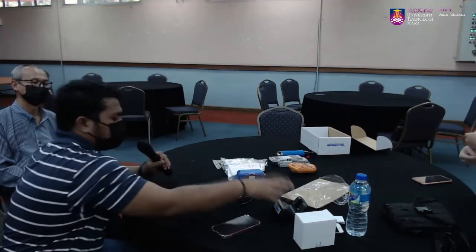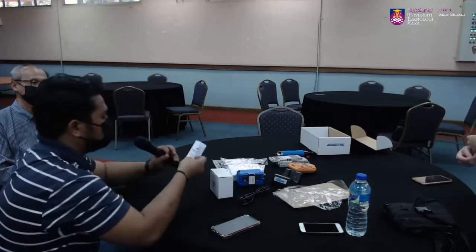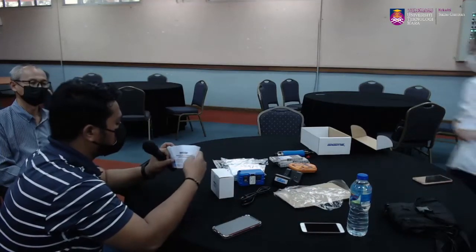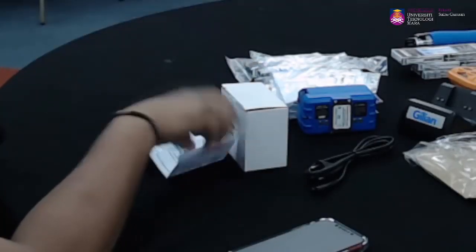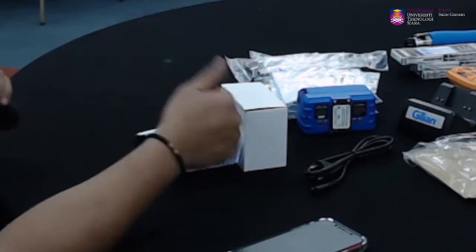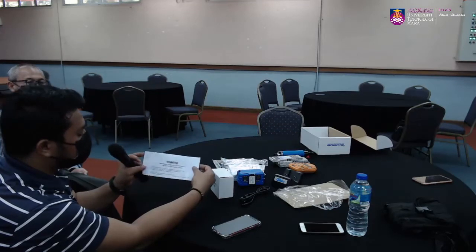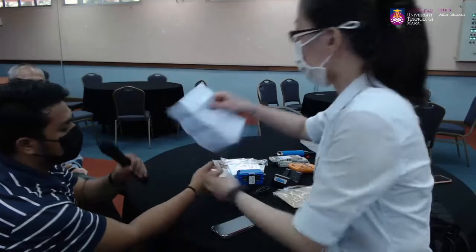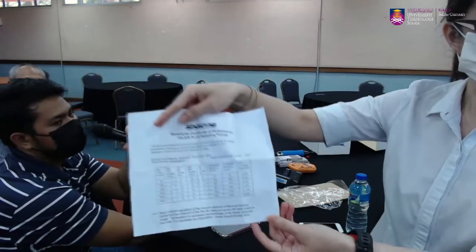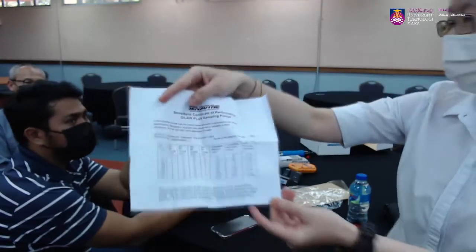Okay. So this is the cover of kita punya air sampling pump lah. So in terms of daripada factory, dia akan bagi juga in terms of certificate of performance. So means that before dihantarkan kepada kita, dia dah buat performance check lah in terms of the pump. So daripada situ certificate ni dia tak perlu renew, kita tak perlu ada yearly annual calibration, tak perlu. It's just in terms of daripada factory mentioning that this unit performance dia okay before leaving the factory lah.